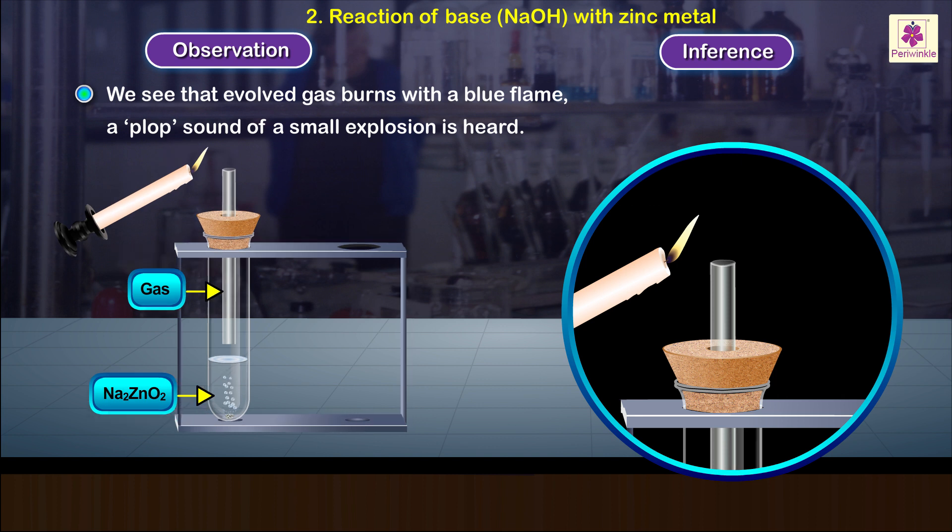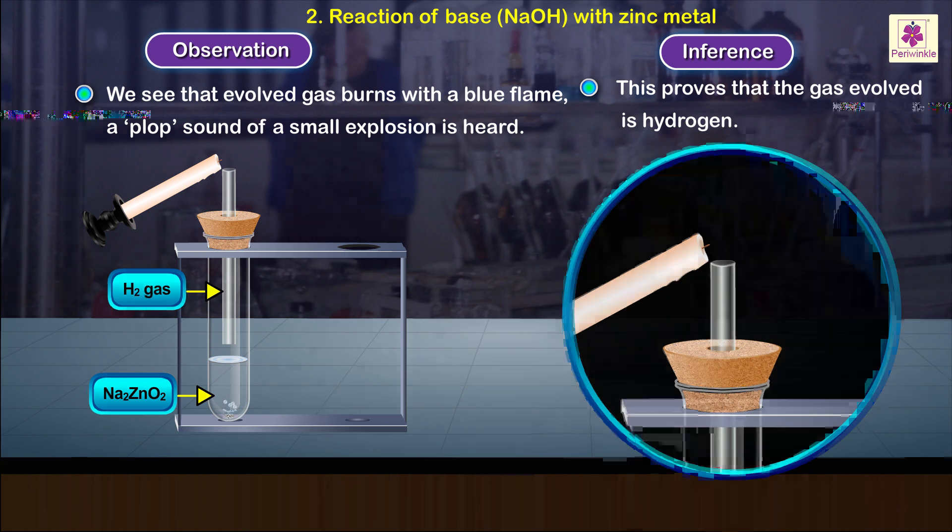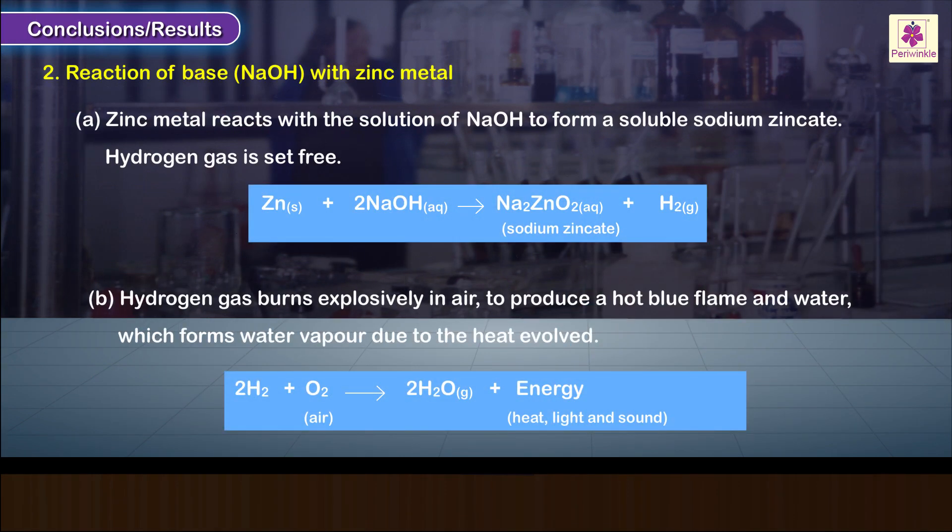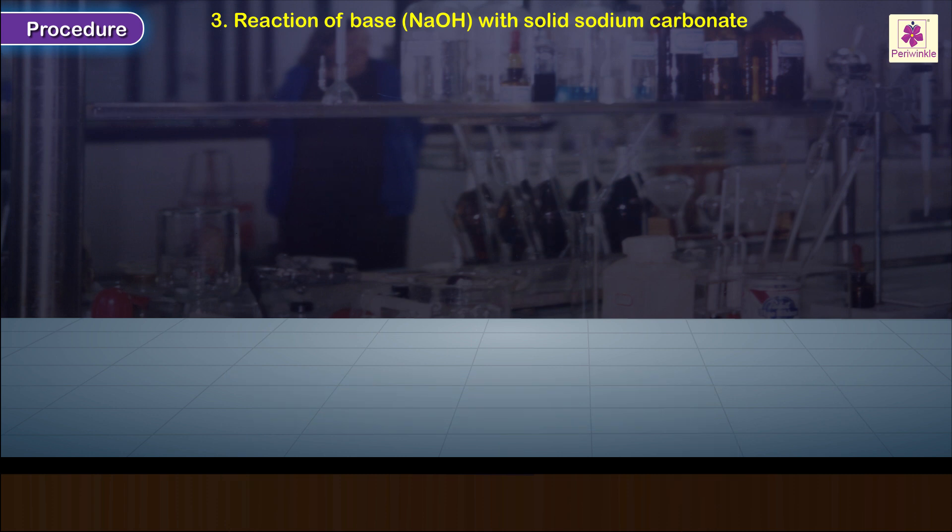We see that the evolved gas burns with a blue flame. A popping sound of a small explosion is heard. This proves that the gas evolved is hydrogen. Conclusion: conclusions or results.